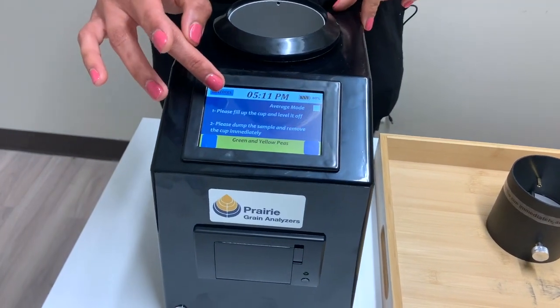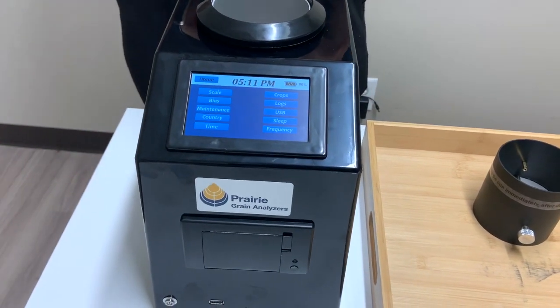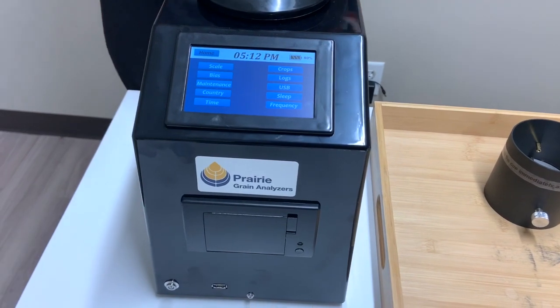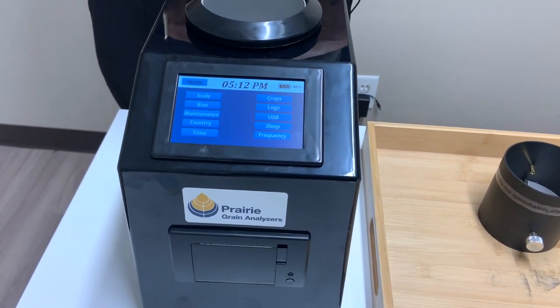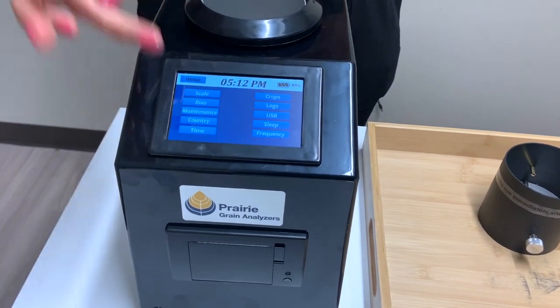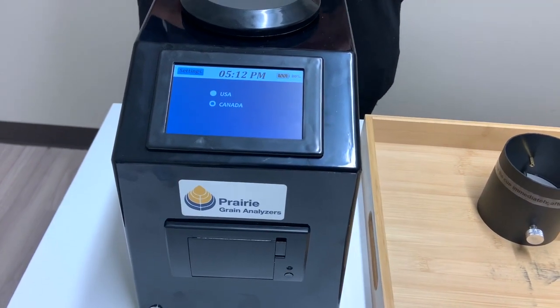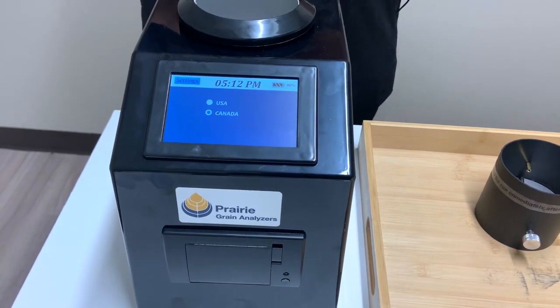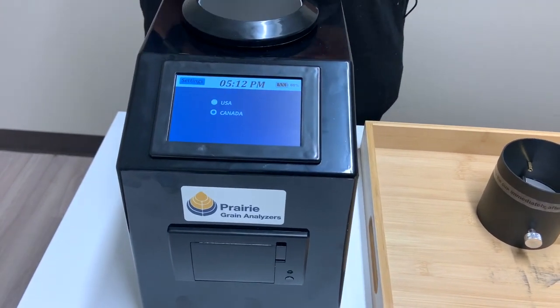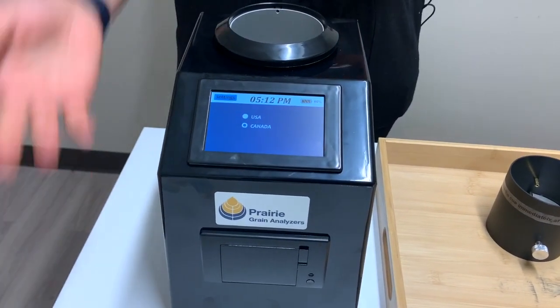We're going to go into the settings and start with the country. When we send out the testers we will pre-select the country, but it doesn't hurt to check. You want to make sure you're on the right country setting — either Canada or the US. If your tester isn't on the correct country setting, click the correct one, go back into settings, and reboot your machine — turn it off and turn it back on for it to reset.